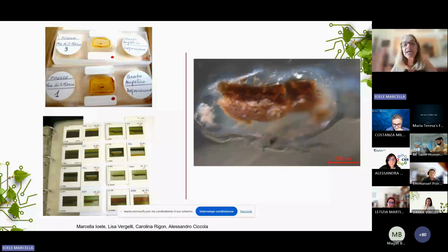And some of the cross-sections, the most damaged by aging, were restored in the 90s during the direction of Michele Cordaro. That means that the sample has been removed from the embedding resin, re-embedded, and re-polished. You can see now the newly embedded resin. And unfortunately, some of the samples were lost in this operation.